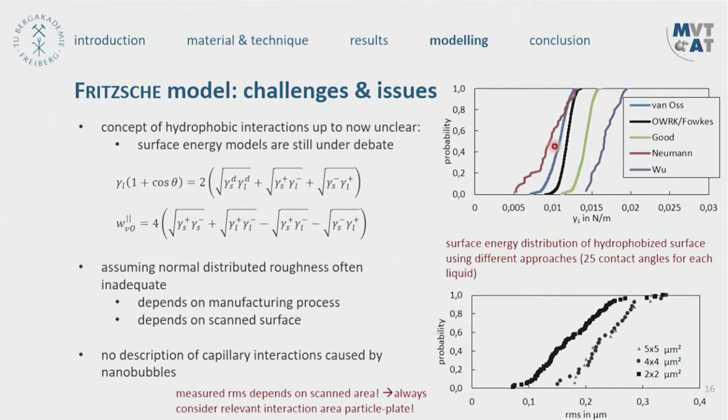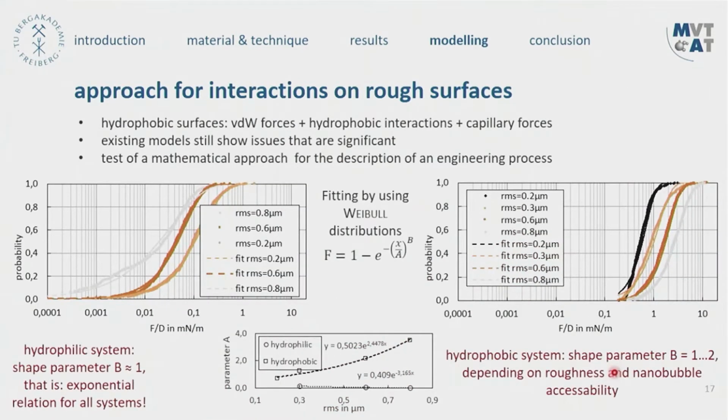So the hydrophobic models are not good enough to provide the baseline of the interaction forces, as well as the question of what kind of surface roughness we should bring in. That is also a point depending on the area we are scanning, because we have the same order of magnitude for the scanning area as well as the roughness area. So we come with a smaller area to influence the measured roughness. So finally, some engineering approach, to keep within the time.